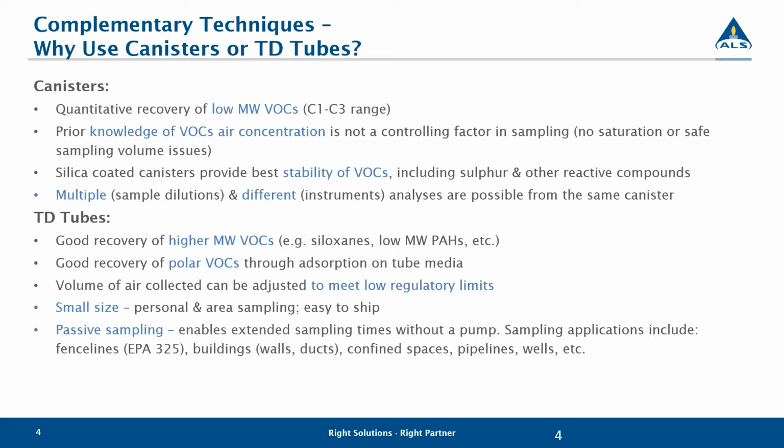So again, the reasons for those two particular canisters needed when you're doing sulfurs and fixed gases is because of the different diluent gases that we're using. If you don't need nitrogen as a report when you're doing fixed gases, let us know, because then you can go down to one canister. There's certainly a cost savings because we do charge for the rental of the two canisters, but we want to be able to give you the best possible data.